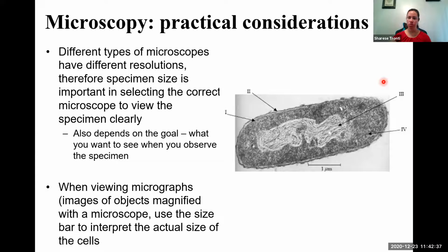Also, when you're looking at pictures or images of different microbes, oftentimes you'll see this scale here. Make sure that you use that to keep in mind the size of those organisms.